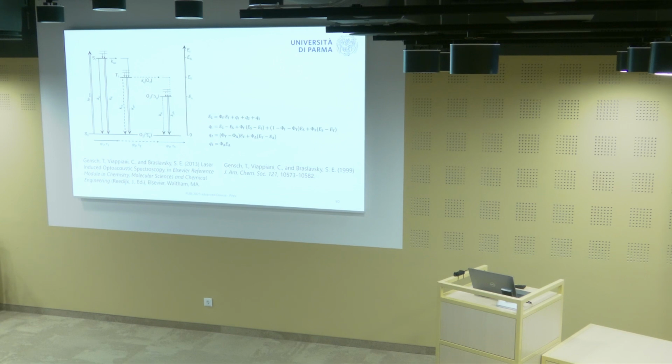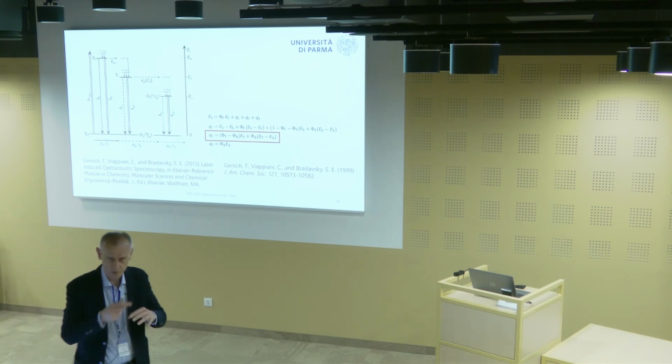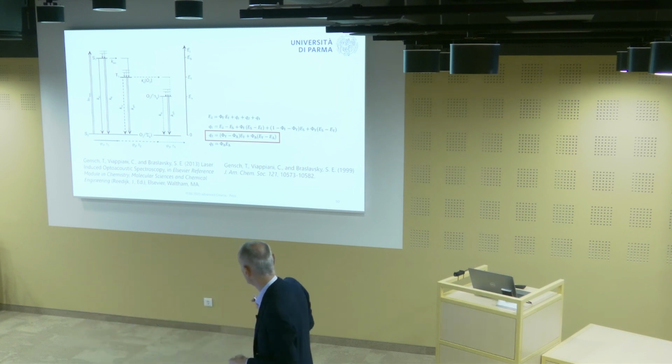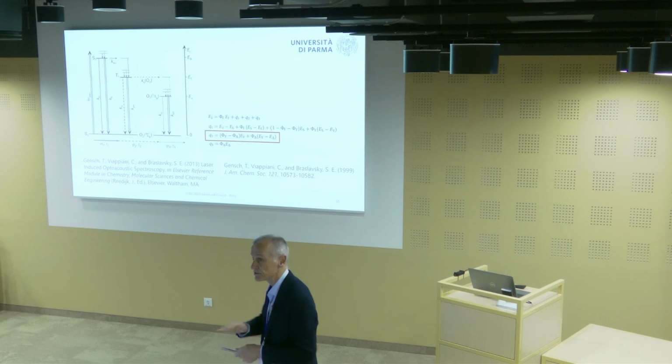So it may be complicated, like in this case, that's the energy balance of the molecule. We don't get into details, but I want to show you that if you plot the equations for the energy content of each of these terms, you can see that, for instance, this one you measure from photoacoustics. This one is known as the triplet yield. This is the singlet oxygen yield. But this one is something that people never know.